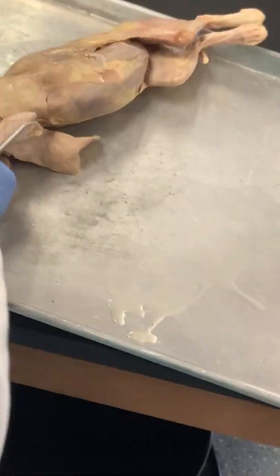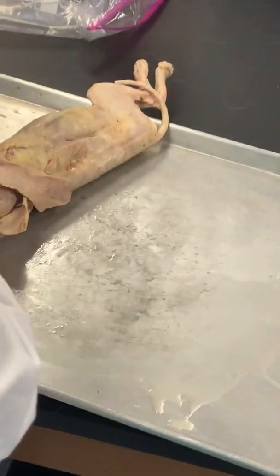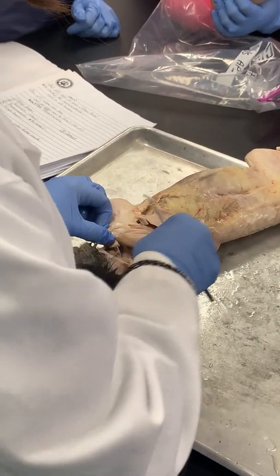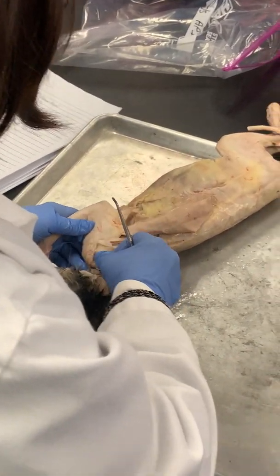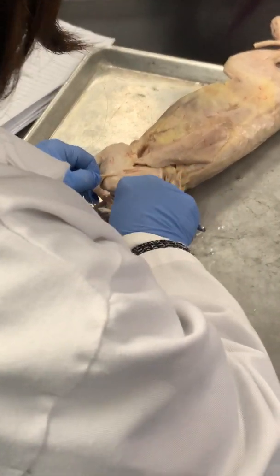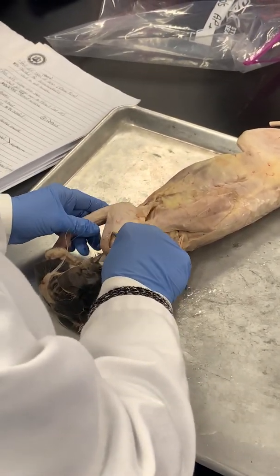All right, so today we'll see how much we can get done. I'm going to stay on this side and we've got to dissect out our muscles. We have to get the deltoid off — this is the hardest thing to get off. I already exposed that one anyway. Chicken wing — think about that next time you eat.